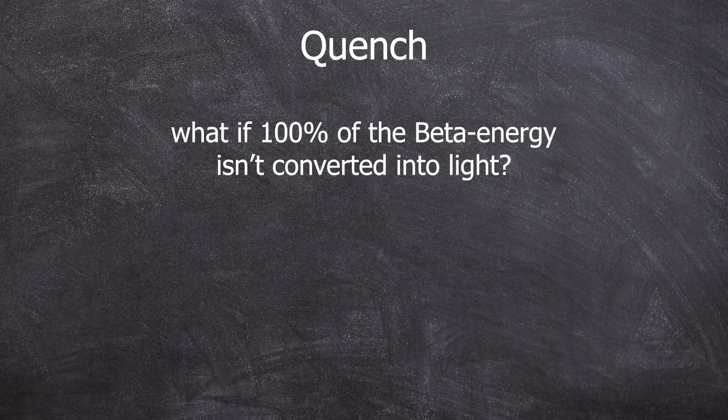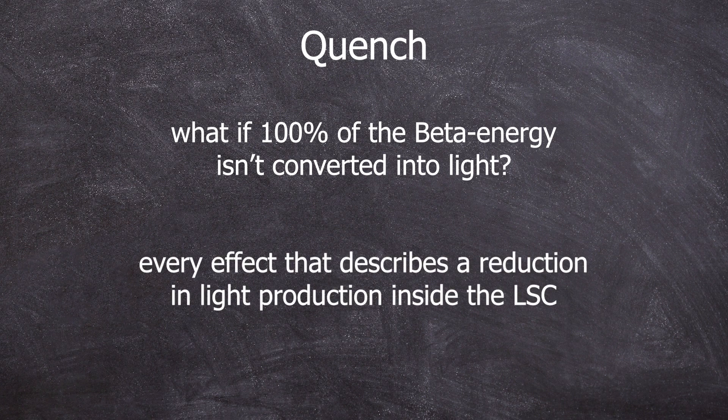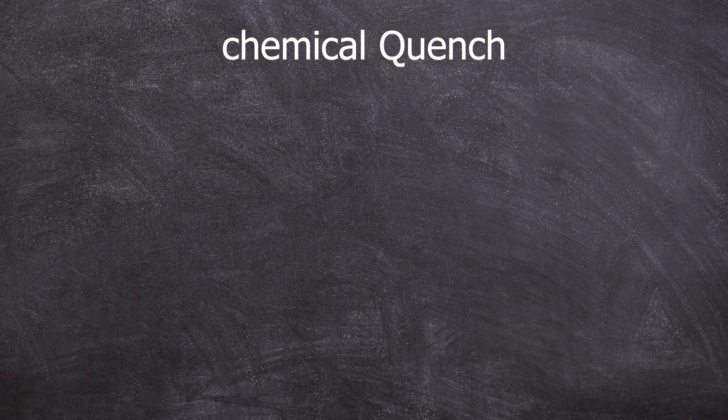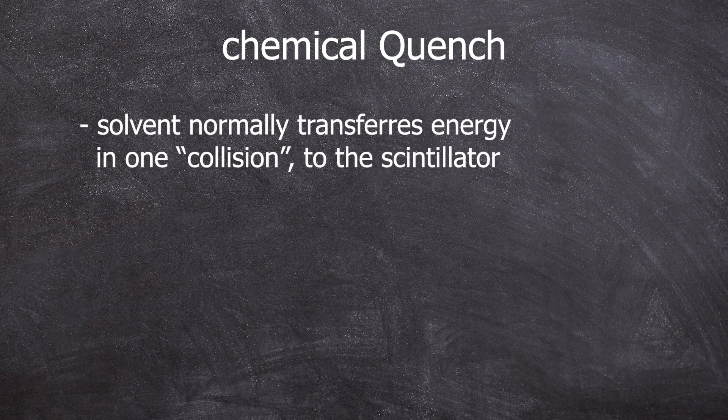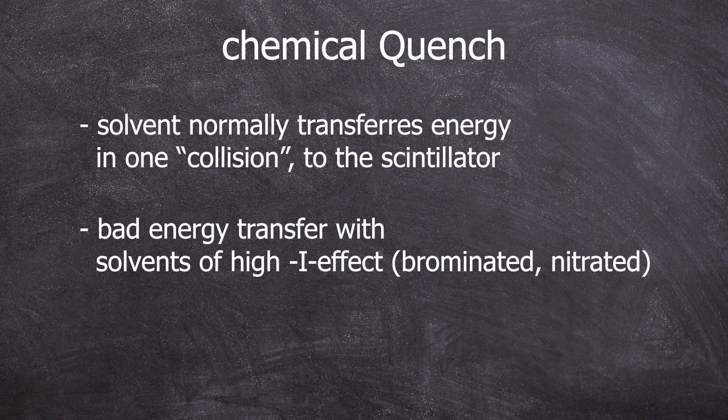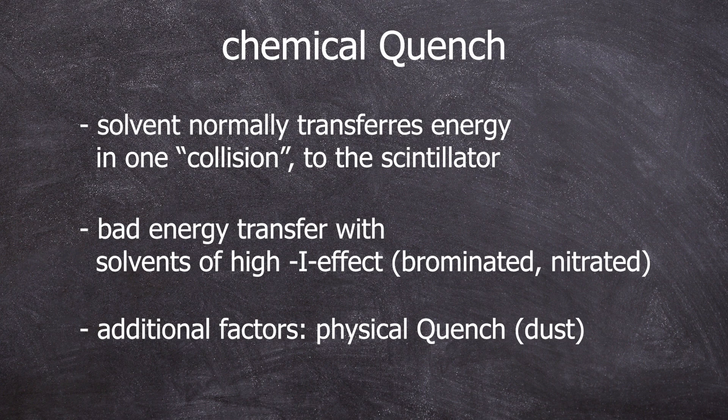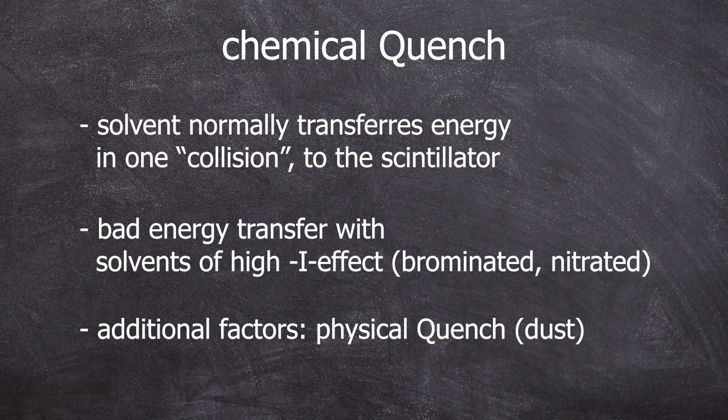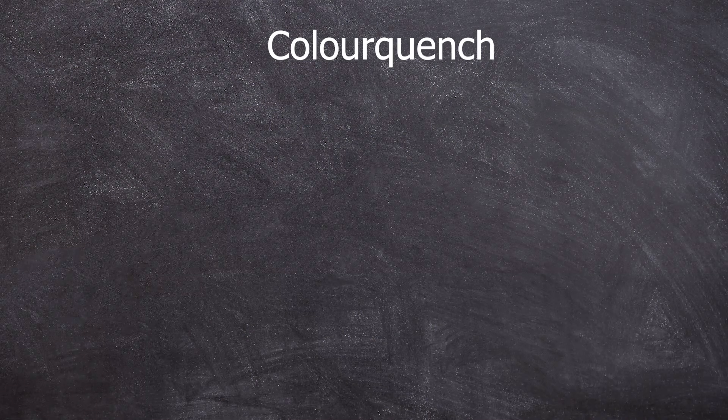Further information you should know. If not 100% of the energy from the decay is indirectly converted into light, we talk about a quench, an effect that leads to a reduction in the light in the LSC. There are different types. The chemical quench, where the solvent does not transfer the energy to the scintillator. Solvents with a high minus I effect, such as brominated or nitrated solvents, do this. There is also a physical quench. If there is dust in your sample, the energy transferred to the scintillator can be disturbed or the light emitted can also be absorbed by dust particles before reaching the detector or the beta particle directly can hit the dust particle.